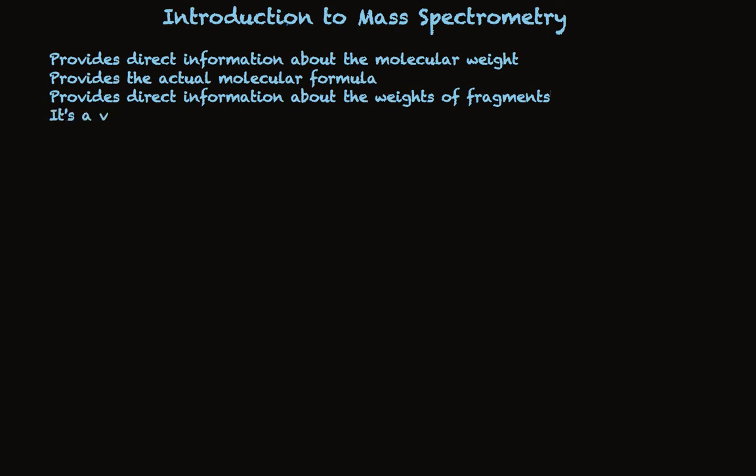It's a very sensitive technique, and that's an understatement. You can use this technique with samples way too small to see. Unimaginably dilute solutions can be examined for their composition using mass spectrometry.